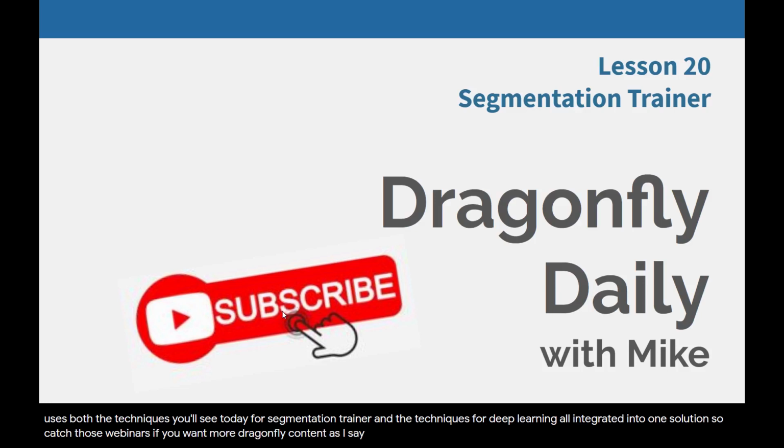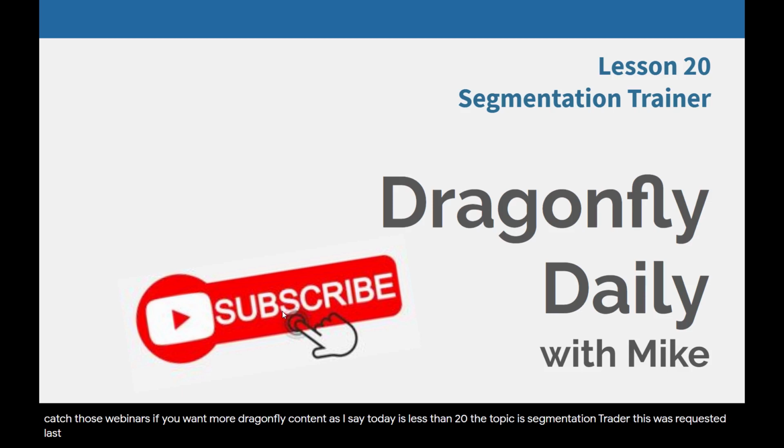As I say, today is lesson 20. The topic is Segmentation Trainer. This was requested last week. People said they want to hear about Segmentation Trainer, and so we'll give it to you today.